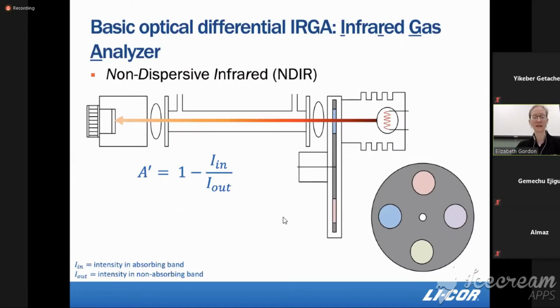Well, we use an IRGA, which you will also see called non-dispersive infrared, or NDIR. For those of you who use the LI-6400, you might have occasionally seen "IRGA not ready." And what that meant was your instrument was telling you that something about the infrared gas analyzer was not working. It might have been something related to your cable or your optical path or something, but whatever it was, the basic measurement was not working.